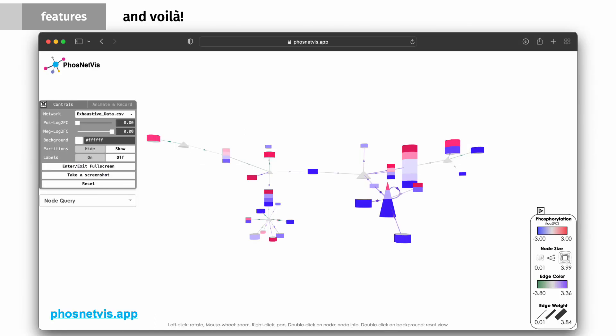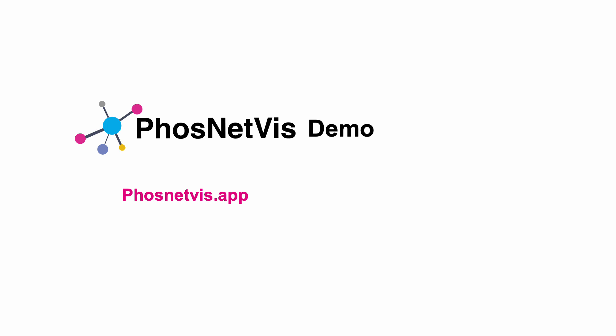And voila! Here we have a snapshot of the PhosNetViz network visualization user interface, where we have a toy network in the middle, with the kinases in triangles, even self-phosphorylation is represented, and we have proteins that are phosphorylated with multiple phosphosites. On the left we have a control panel, on the right we have the figure legend. Now we will have a quick demo of PhosNetViz.